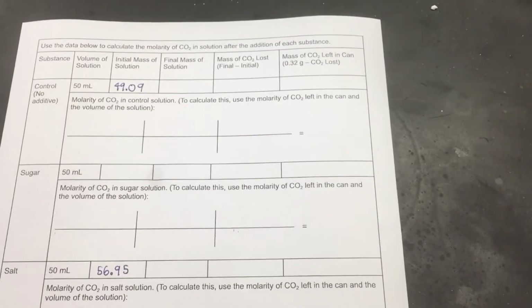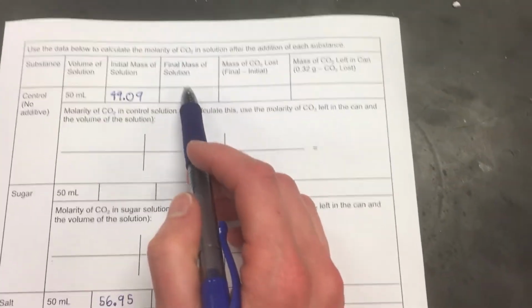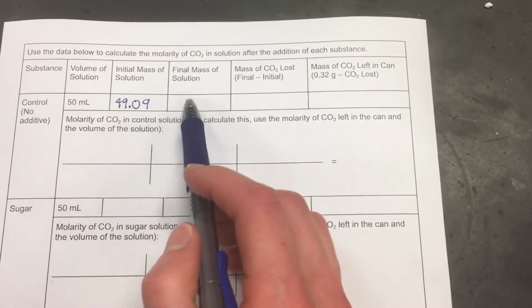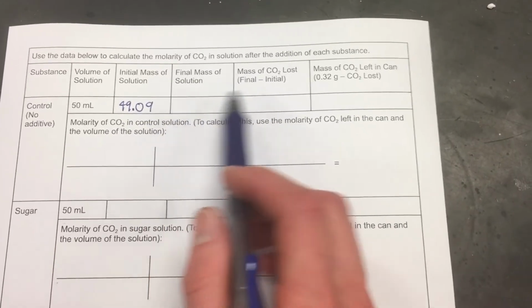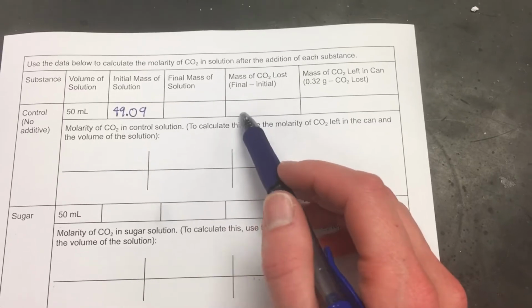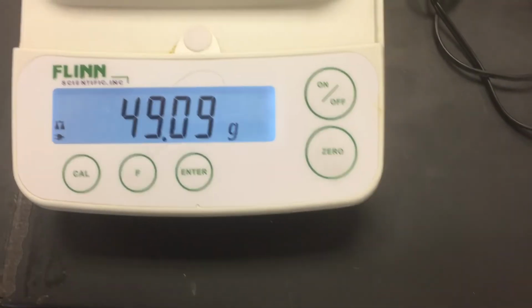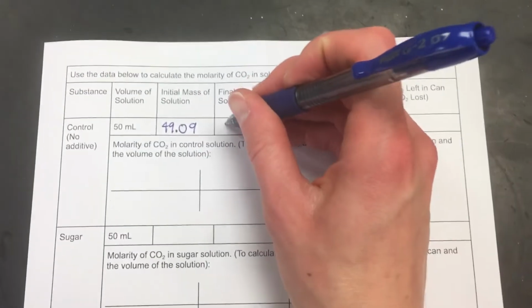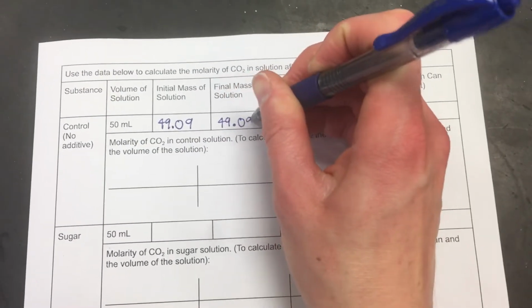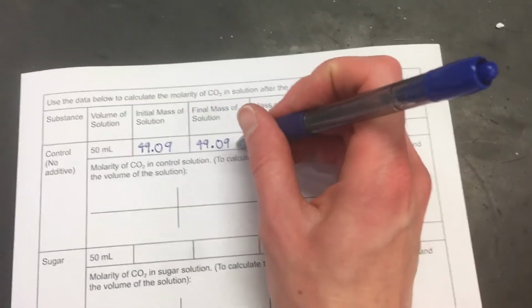So maybe we need just a few more minutes, or maybe a few more seconds. In the end, we're going to take the final mass minus the initial mass, and that will show how much CO2 was lost, if any. Okay, so we're just going to look now. My control is still at 49.09, so it didn't really lose any CO2. So we can say 0 grams of CO2 was lost. These are all grams.